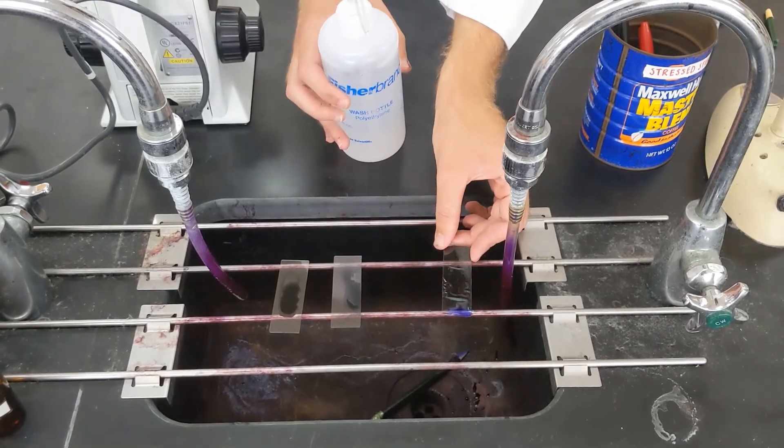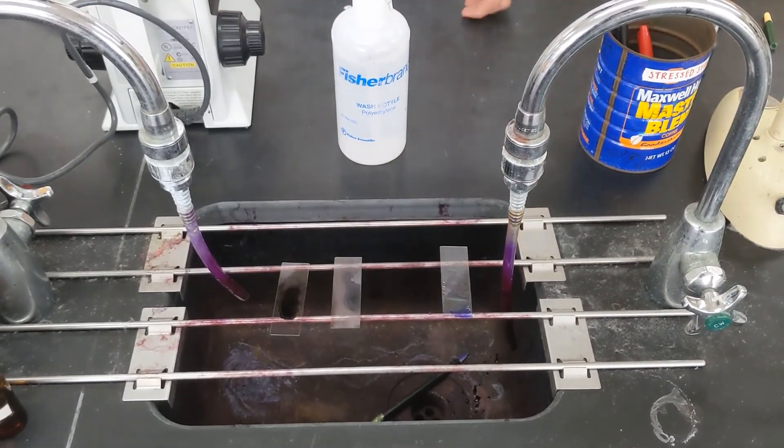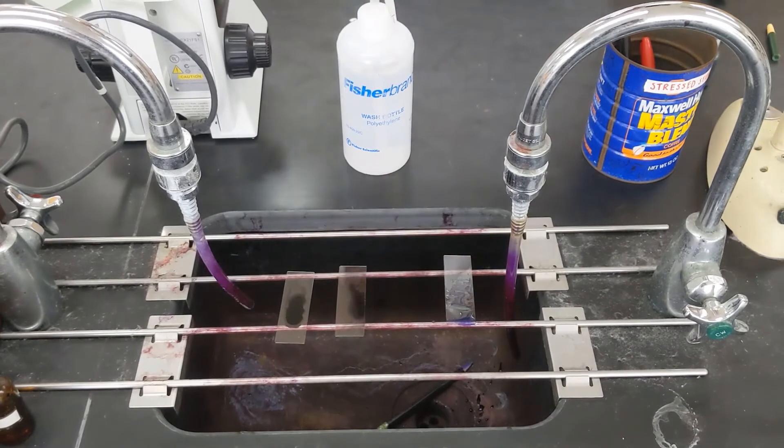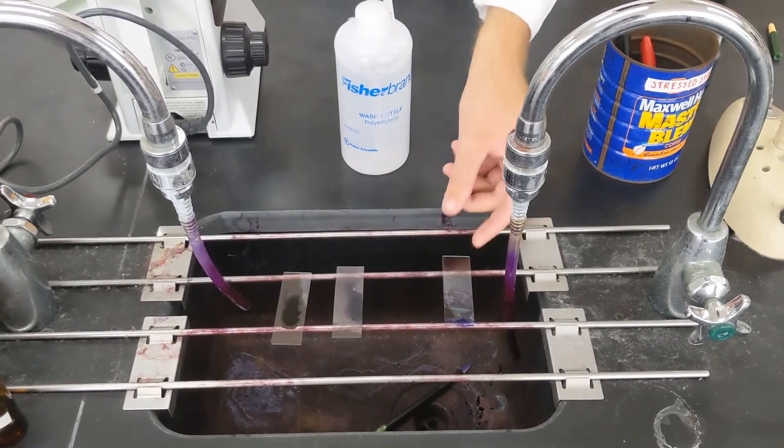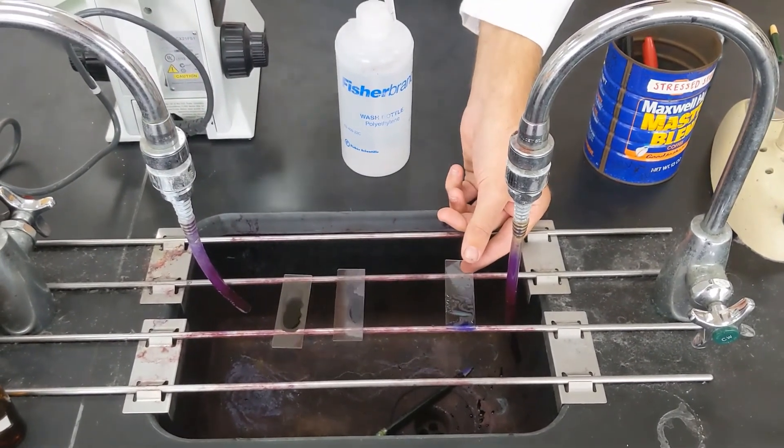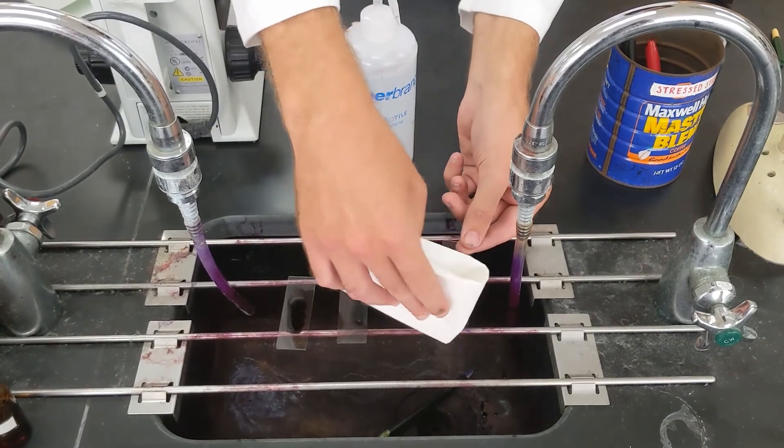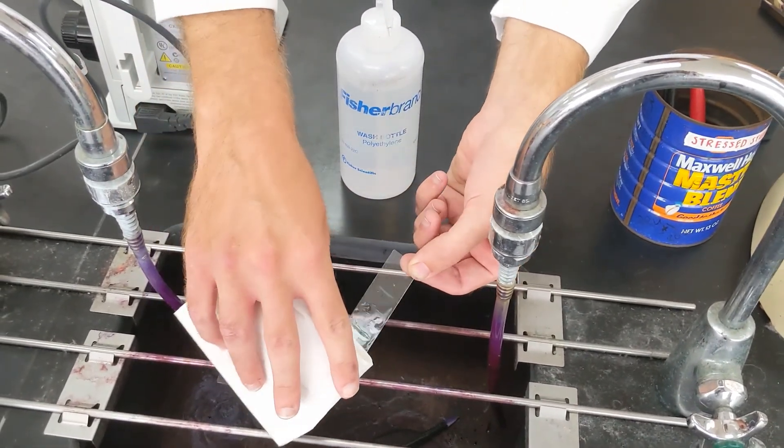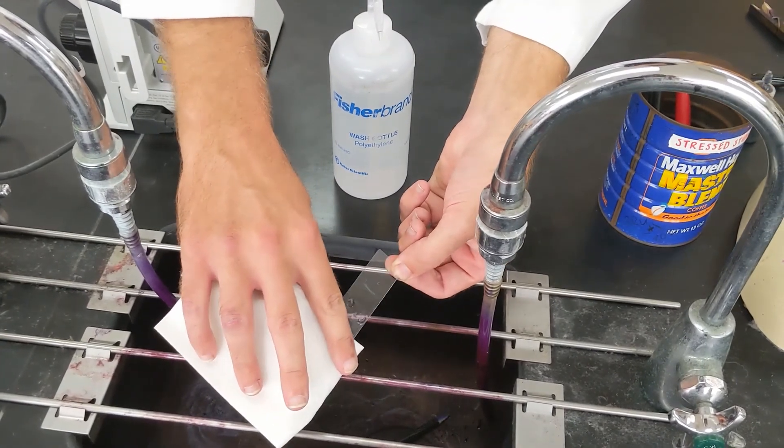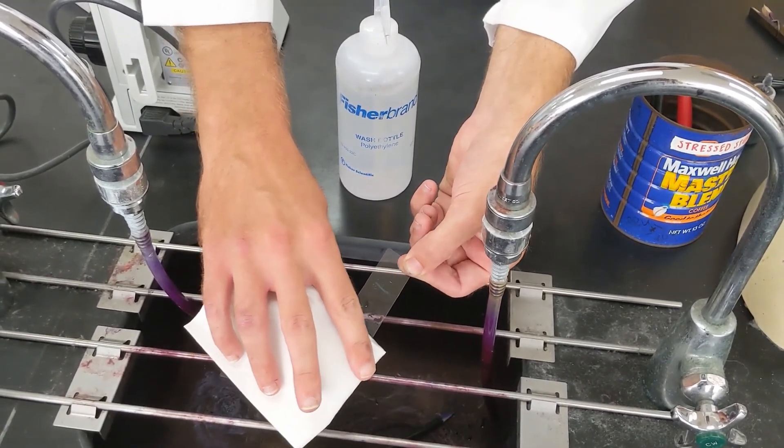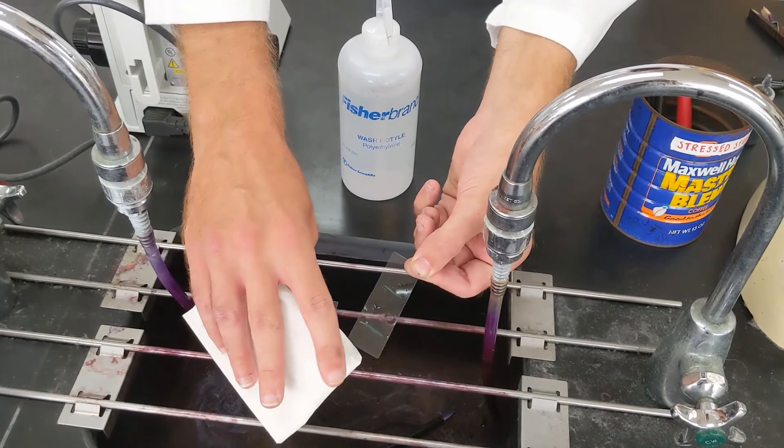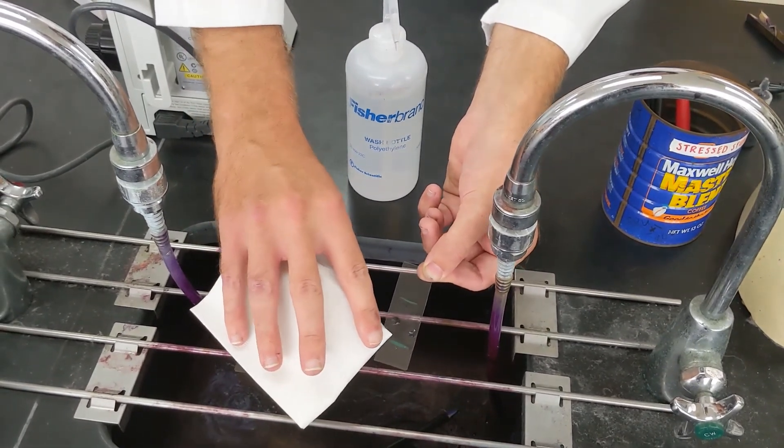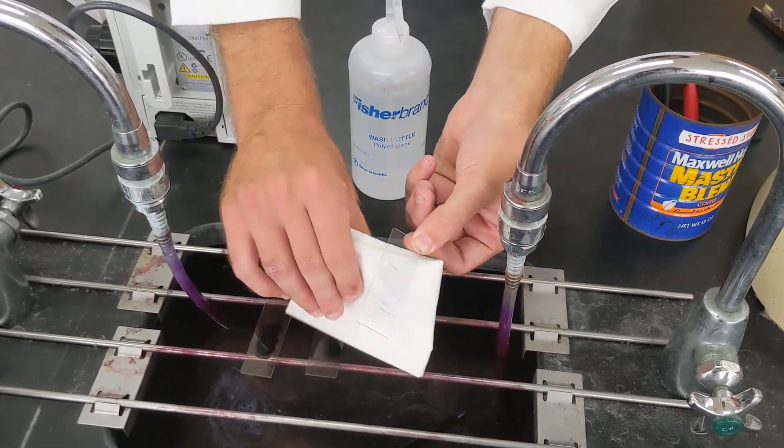Now after that, to dry off the slide, take a paper towel or a kim wipe, either works, and just kind of touch the edges gently. So kind of just blot it dry. It's important right now that you're not wiping off the slide really, really hard, because if you wipe off the slide, there's a chance you'll wipe off the bacteria as well. So just kind of just touching it is most important.